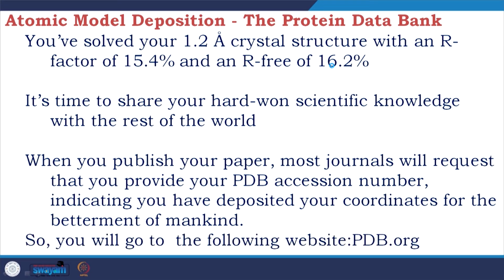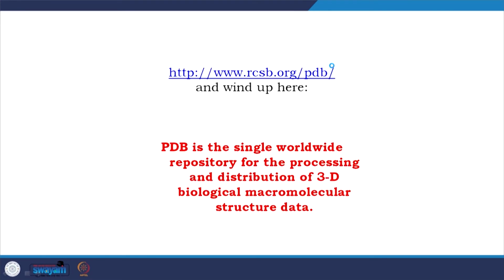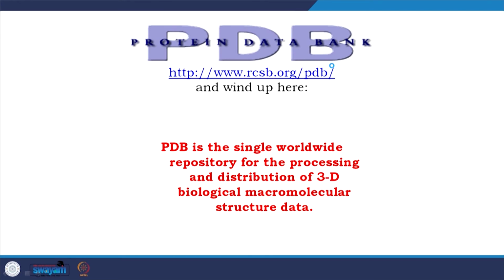So, then you go to the following website, pdb.org, we will talk about. So, this is the Protein Data Bank, and PDB is the single worldwide repository for the processing and distribution of 3D biological macromolecular structured data.